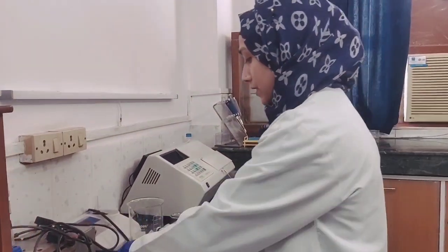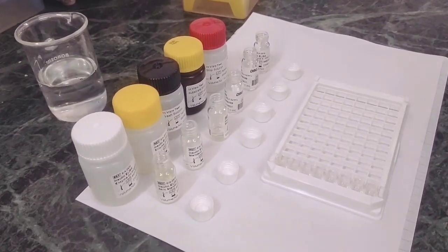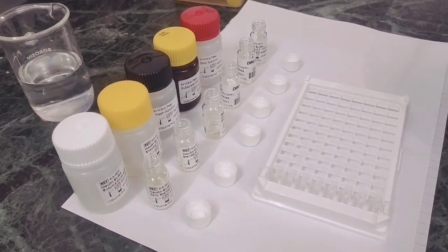The first step is to add the standards or the sample, 25 microliters in each well.